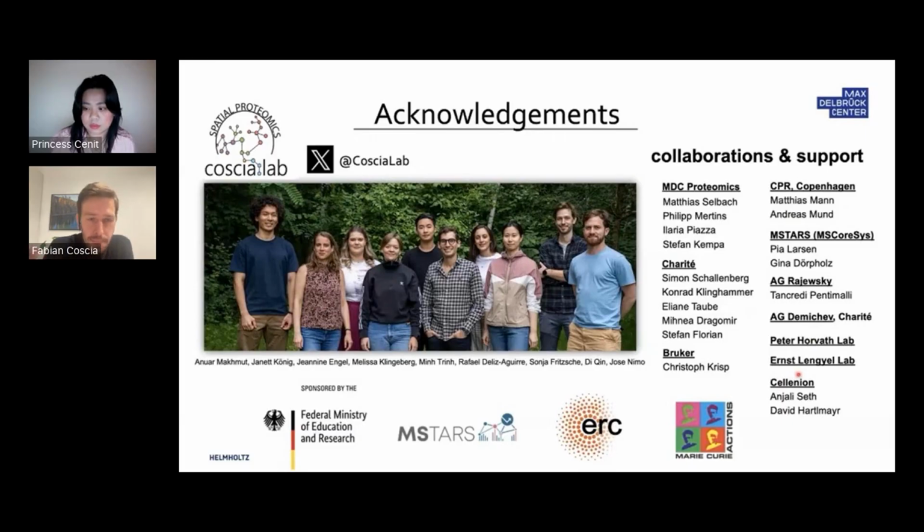So I think the same holds for RNA and protein correlations and multimodal spatial proteotranscriptomics methods. Here the power is really in combining, leveraging the advantages of many different technologies, right? I also mentioned this in the previous talk, there is no single technology that really has all the advantages. We always need to find good strategies to integrate and combine them. And this could be imaging-based approaches together with LC-MS.